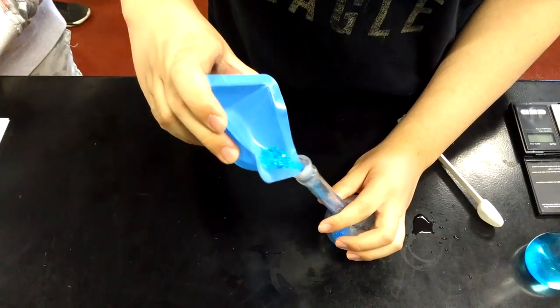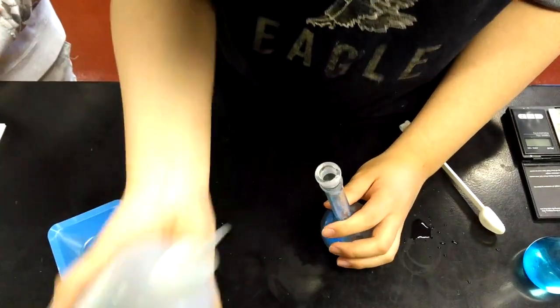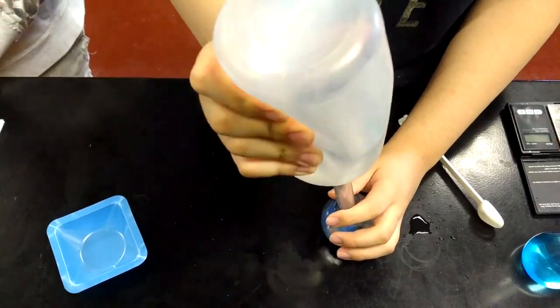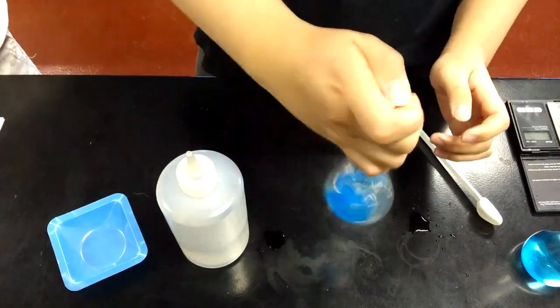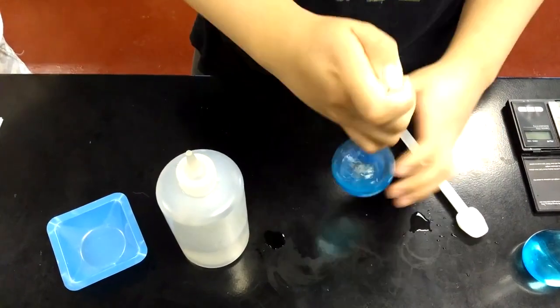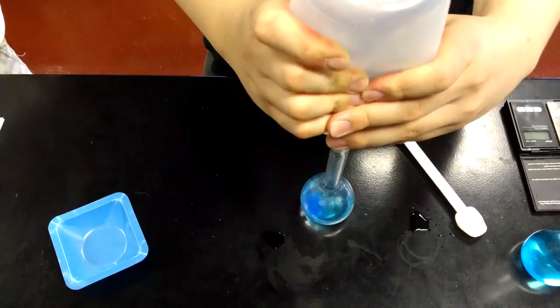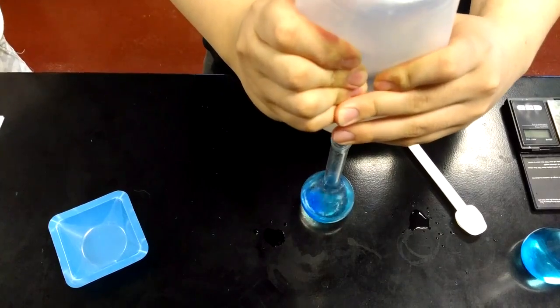Add the copper 2 sulfate to the volumetric flask. Pour some water into the flask and dissolve. Fill the rest of the flask up to the line with water.